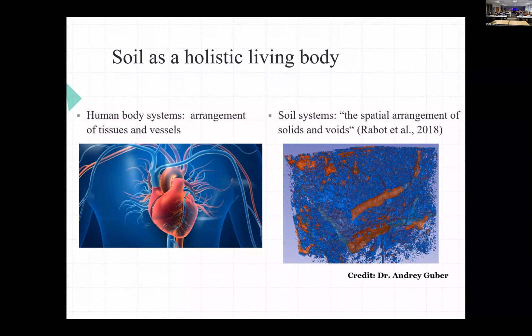I'm a big fan of X-ray CT, because it offers a great opportunity of studying soil as a holistic functioning body. An analogy that I like to think of when I'm thinking about soils and CT is the human body.